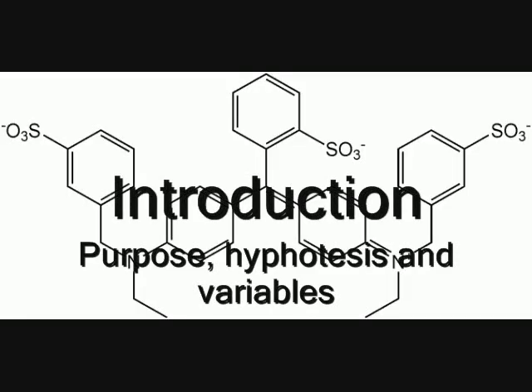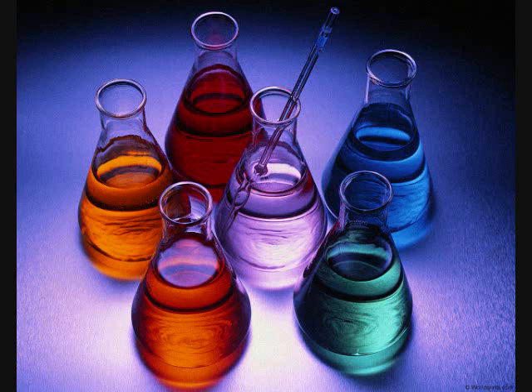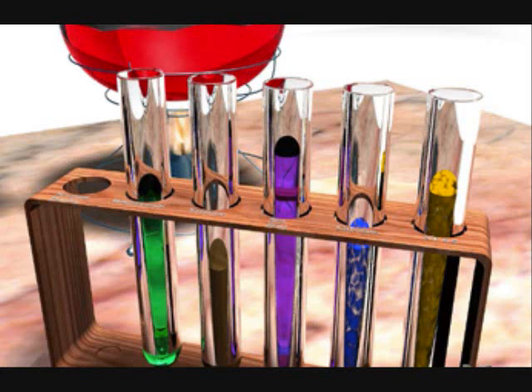We are interested in studying dyes because we want to know how to make products with artificial dyes, such as Gatorade, like the store brands do. We are interested in studying the Blue No. 1 dye present in Gatorade Blue Glacier. The Blue No. 1 dye contains 3 benzene rings attached to a central carbon, known as triarylmethane, which is a chromophore that makes the Blue No. 1 dye have a blue color.